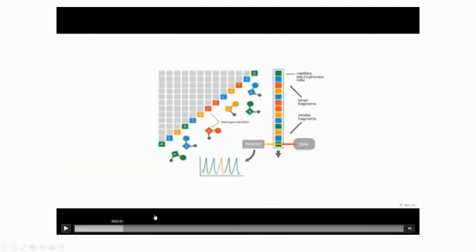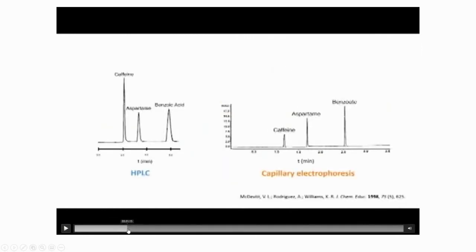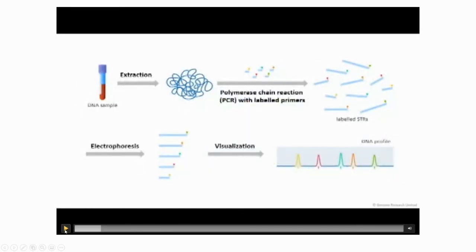So here, this is the result of the capillary electrophoresis, because it can arrange the DNA fragments based on their size, with the smaller fragments going through the detector first. So all these different analytes can be used in capillary electrophoresis. Okay, so let's go through the principle of capillary electrophoresis. Color peaks highlight the different lengths. This is the result of the capillary electrophoresis.